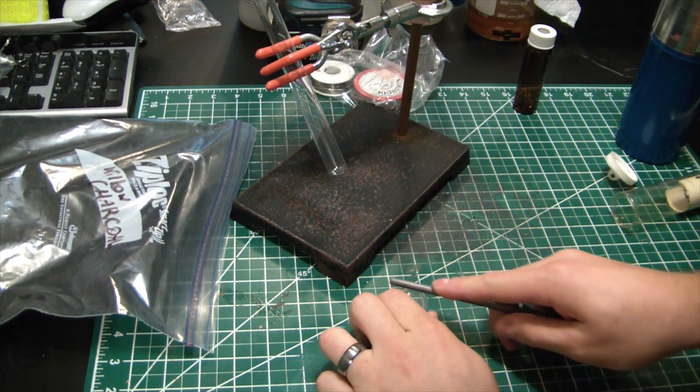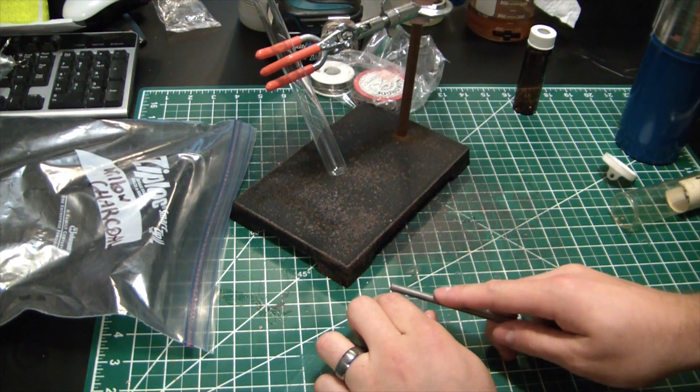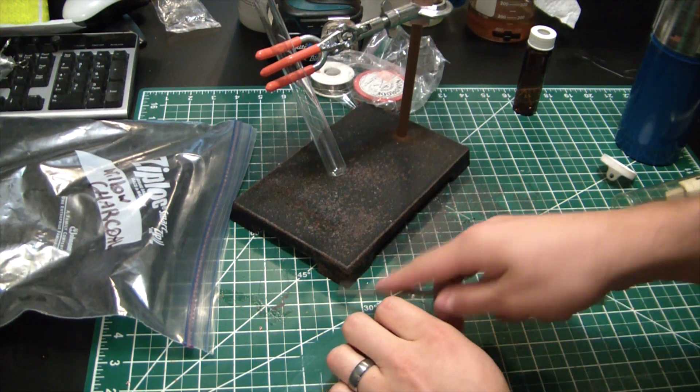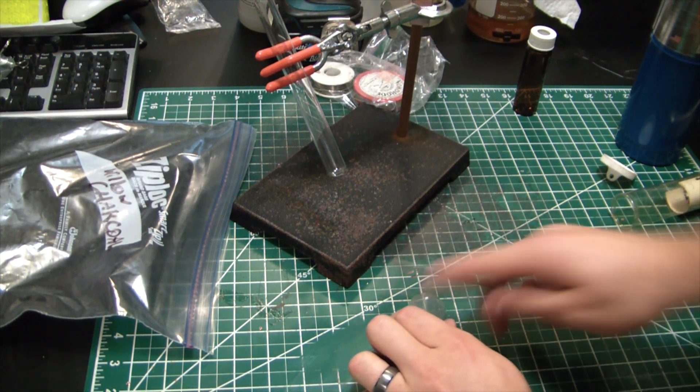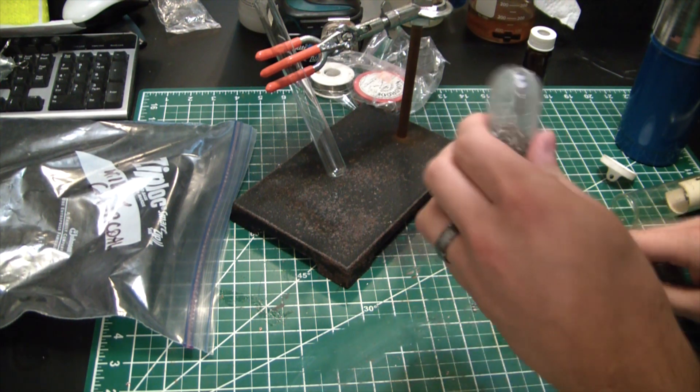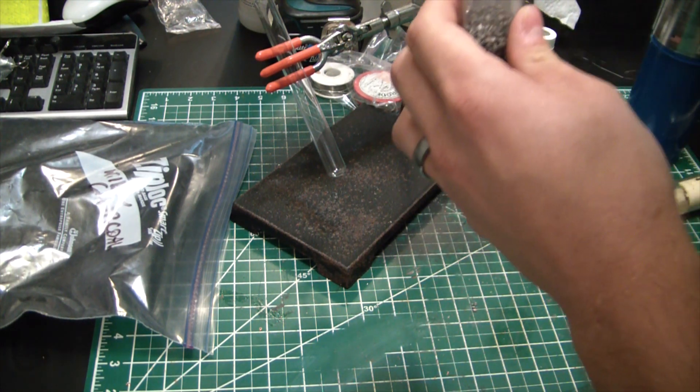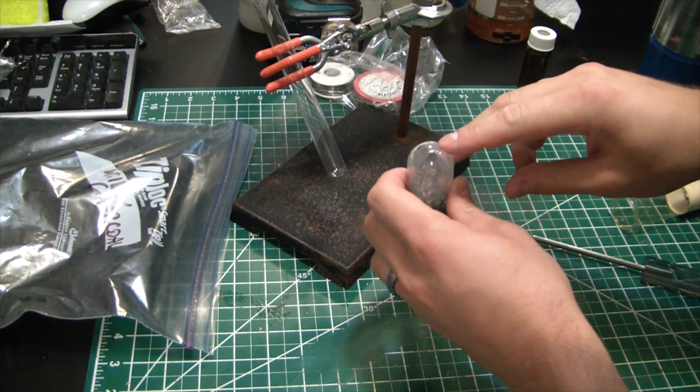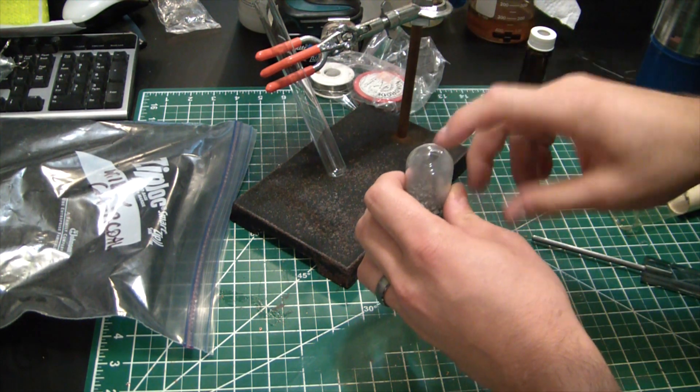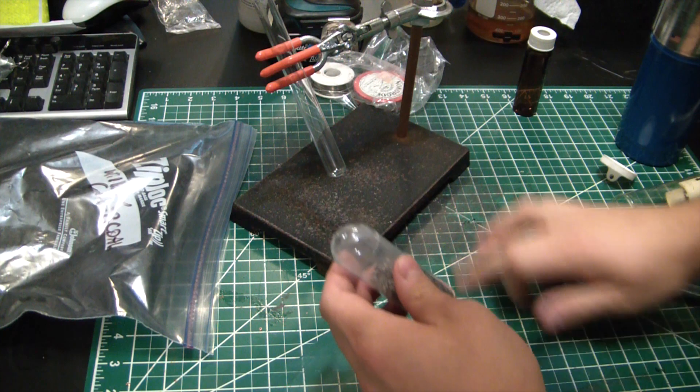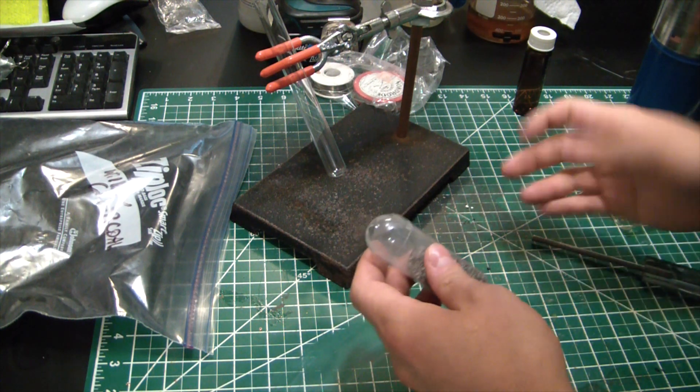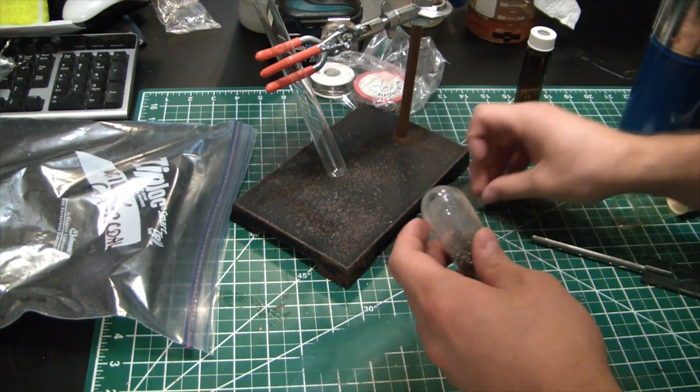I'm just going to score this vial here so we hopefully get a nice clean break with a diamond file. Oh shit, the top already broke! How the hell did that even happen?